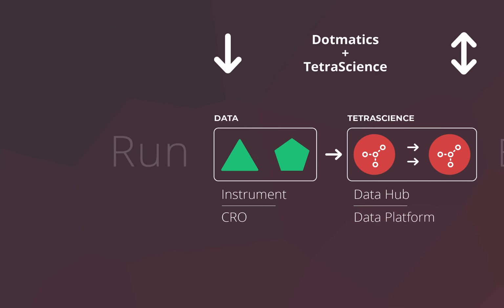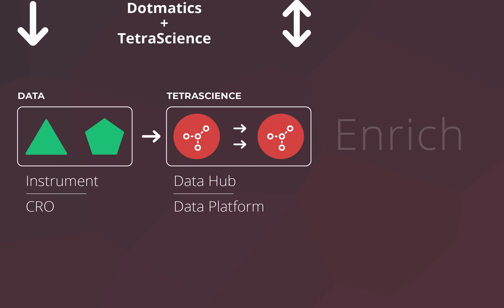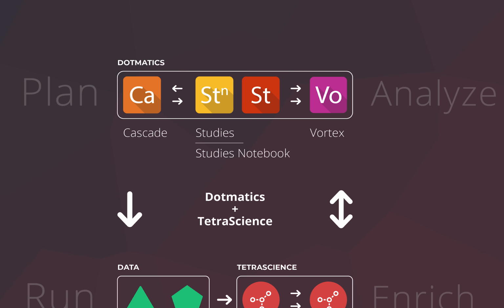We'll take a look at data flowing from the source, in this case a plate reader, into TetraScience, where it's standardized and then moved into multiple Dotmatics applications automatically.